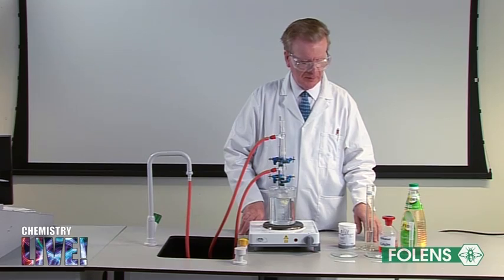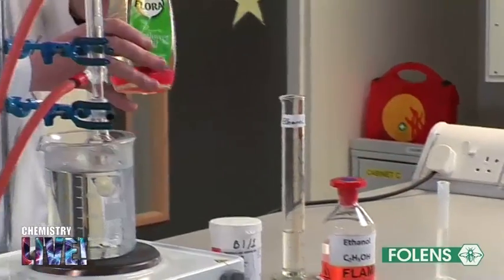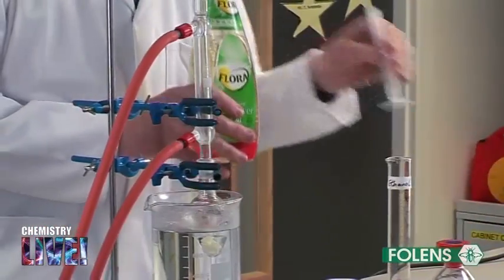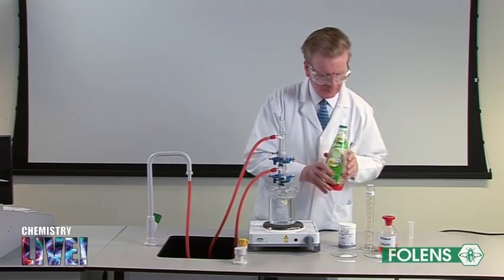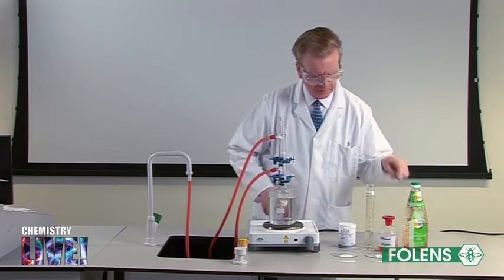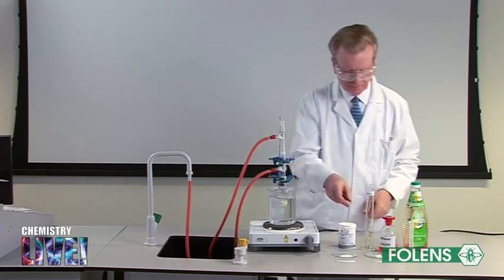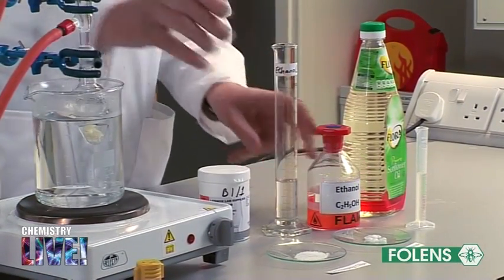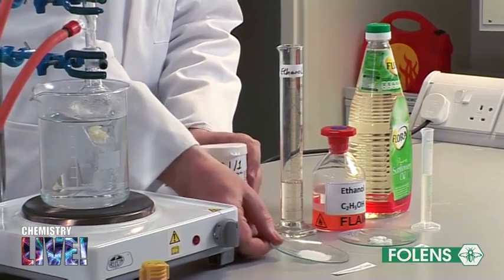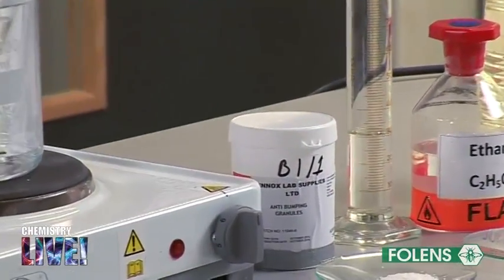6 cm³ of sunflower oil have been placed in a 100 cm³ quick-fit flask. 3 grams of sodium hydroxide pellets, 30 cm³ of ethanol, and some anti-bumping chips have also been added to the flask.